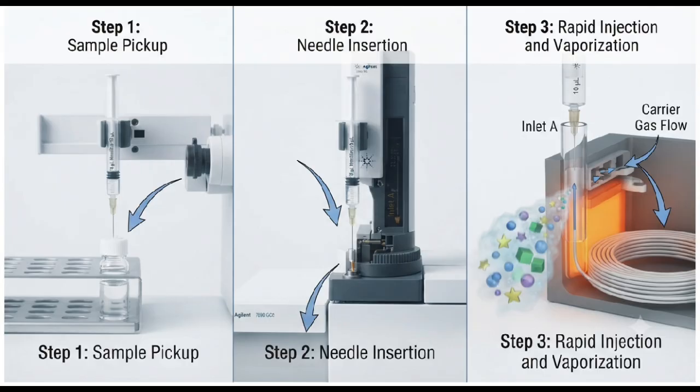The injection technique and inlet conditions are extremely important because poor injection can cause problems such as discrimination, poor peak shape, carryover, or inconsistent response.